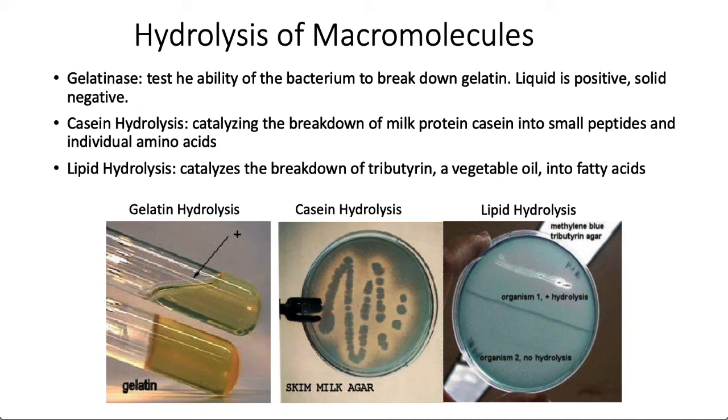Casein looks at the ability of breaking down this protein called casein. It's a milk protein, and it is used in an agar that contains milk, and a positive reaction is observed with clear halos around the colonies.